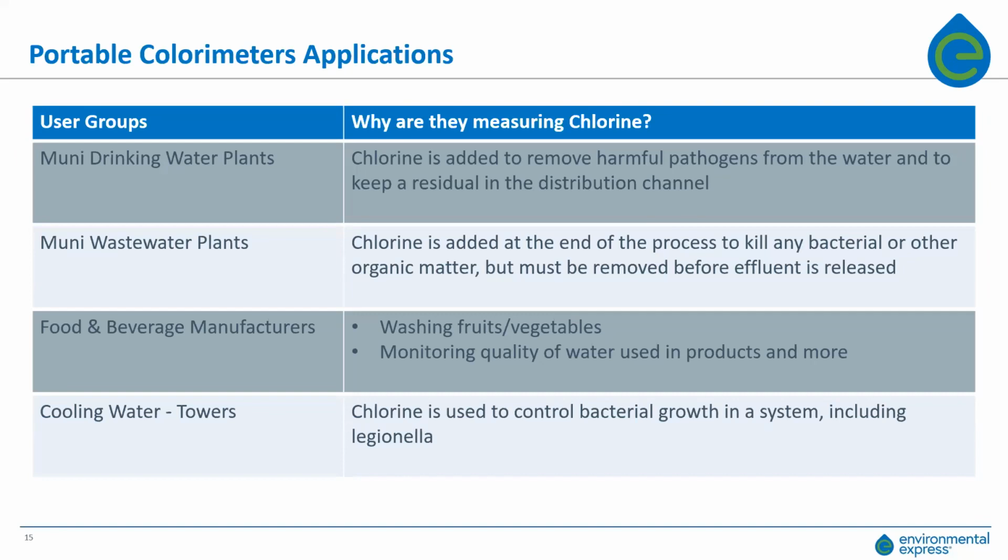Another key application is for food and beverages. Specifically, I've helped multiple customers with sanitizing baths. So these folks are essentially washing fruits or vegetables in a 10 to 20 part per million chlorine bath. And of course, they're thoroughly rinsed and cleaned after that.